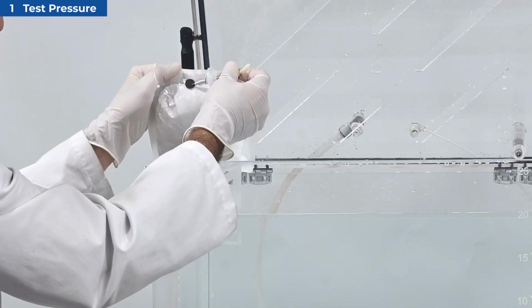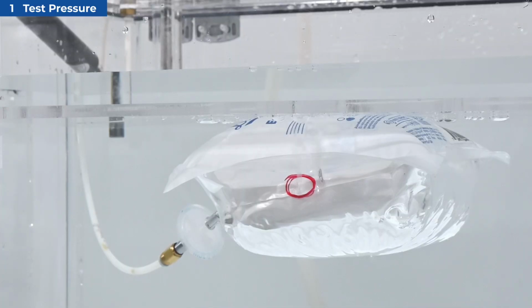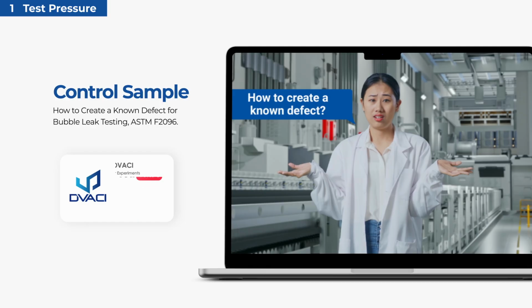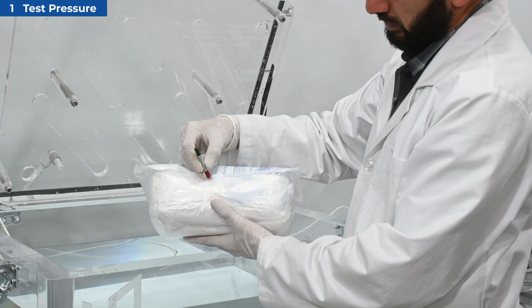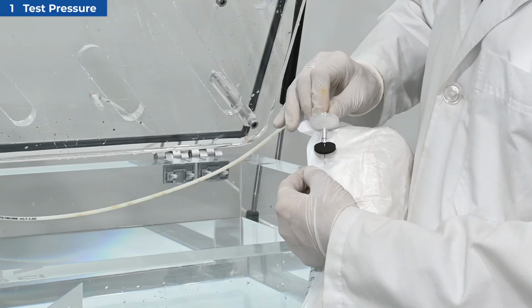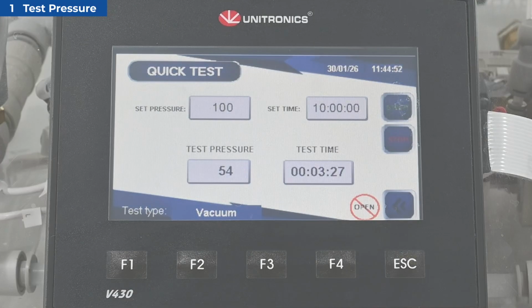ASTM F2096 requires first using a package with a known artificial defect. At DVACI, we have published a video showing how to create a control sample, and we invite you to watch it if you have not already. This sample is critical because it allows you to identify the minimum pressure at which a real leak becomes visibly detectable underwater. That pressure is your starting point.